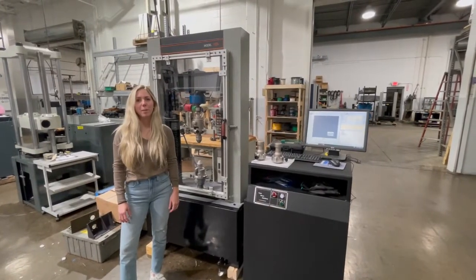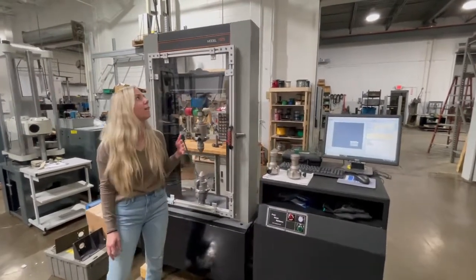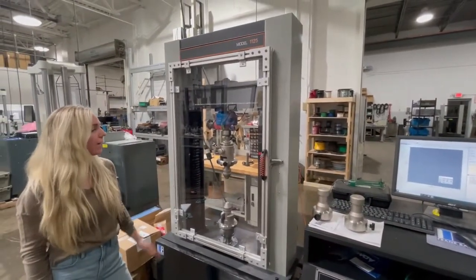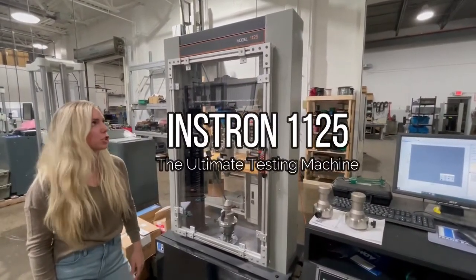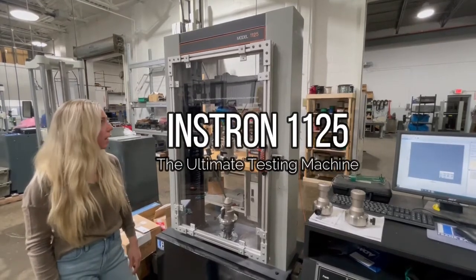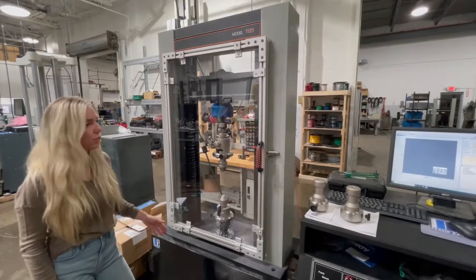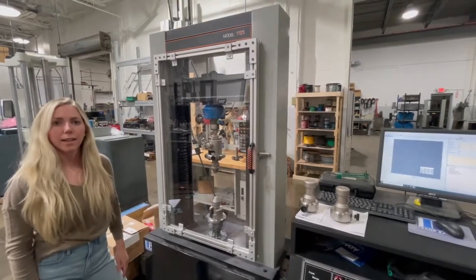Hi, this is Katrina. I'm here at Frank Bacon Machinery Sales Company. Today we have a Frank Bacon Difference video on the Instron Model 1125. This is the ultimate testing machine — you cannot find this machine anywhere else. Jeff is going to take you through the major things we redid and retrofit on this machine.